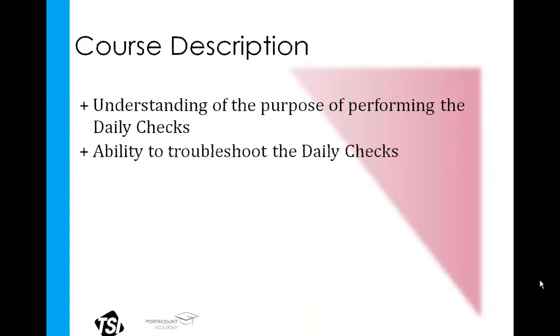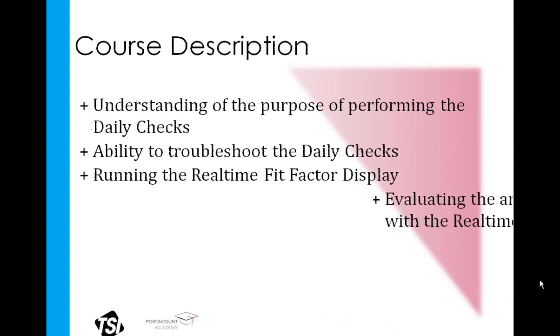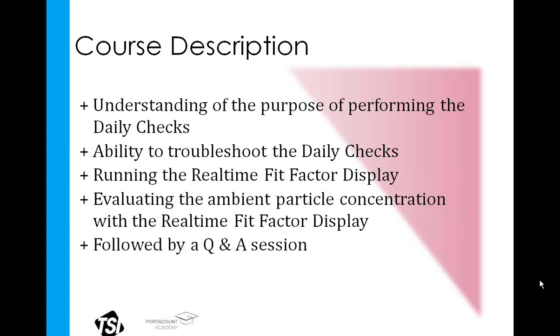Now, this course is intended to provide a greater understanding of the daily checks and the purpose behind performing the daily checks, and within the same discussion, how we can troubleshoot those daily checks if and when we do run into an issue. We are also going to discuss the real-time fit factor display and specifically how it can help us troubleshoot both the zero check and the ambient particle check.